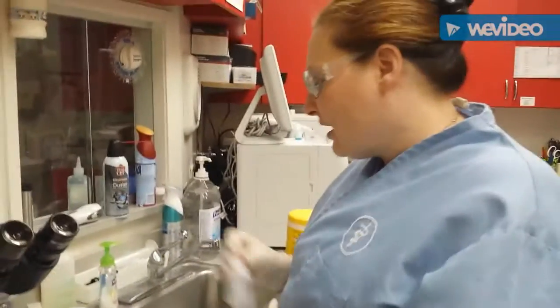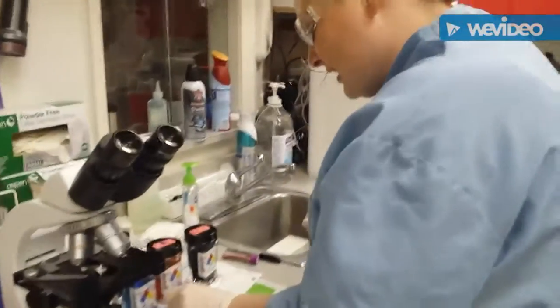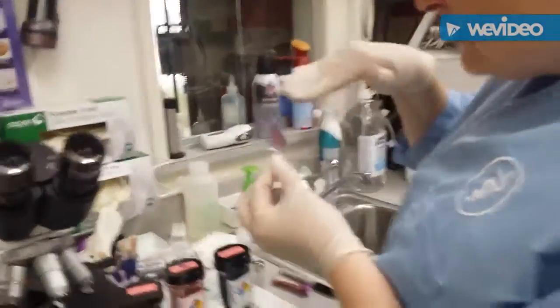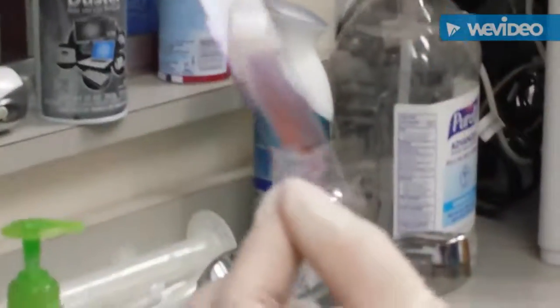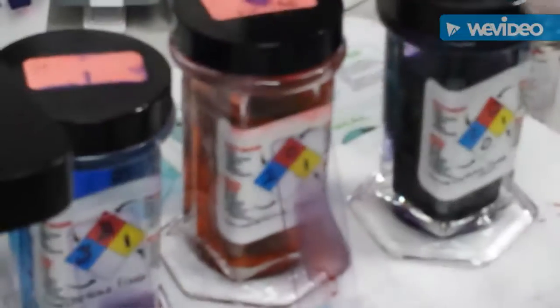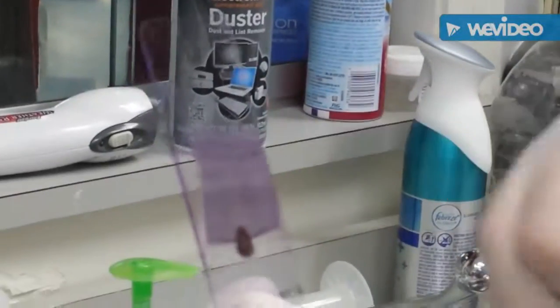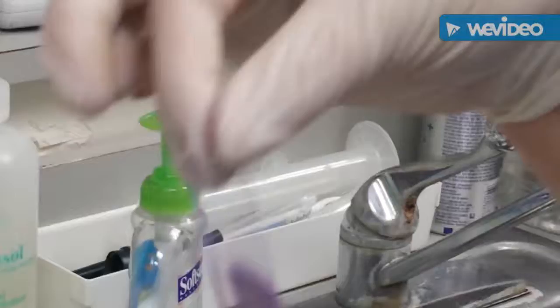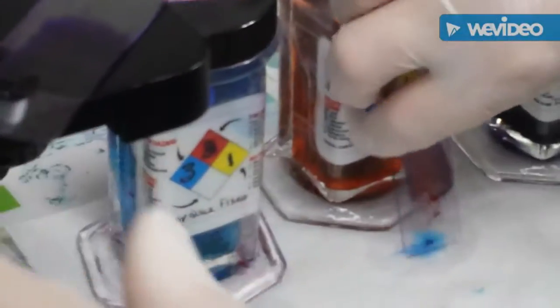So we are back. Our slides have now air dried and they are stained. So our first slide doesn't seem to have any empty spots or bare areas or lines through it. So that one is ready to be viewed under the microscope. And then as you can see, our other one kind of looks like I must have lifted right here, and you can see some lines there. So that's probably not the best slide to view. So they are now ready to be looked at under the microscope.